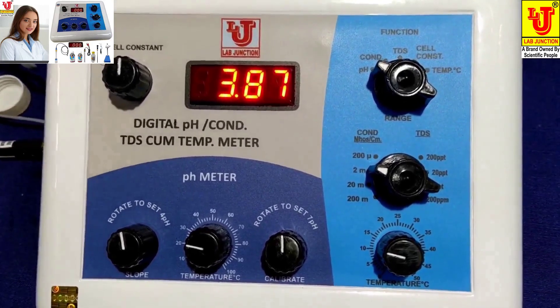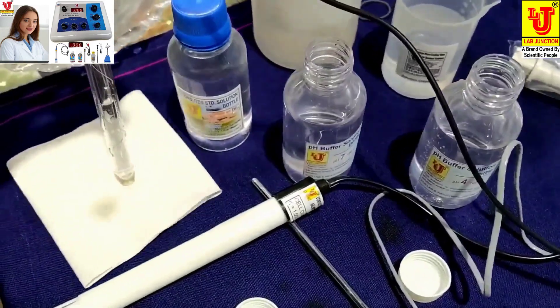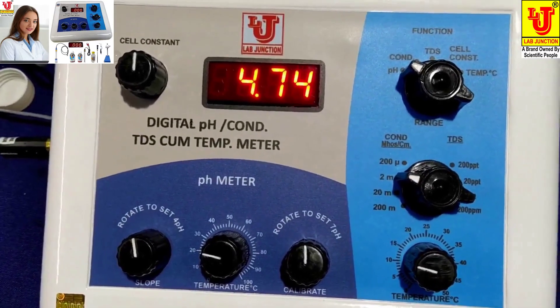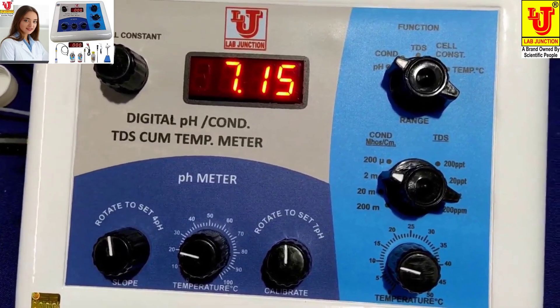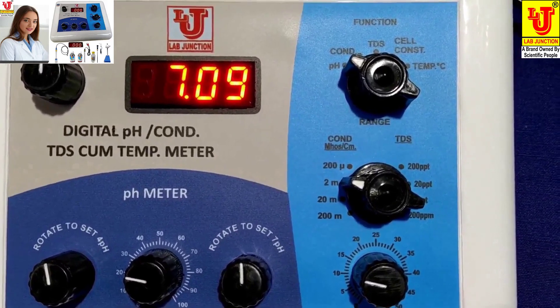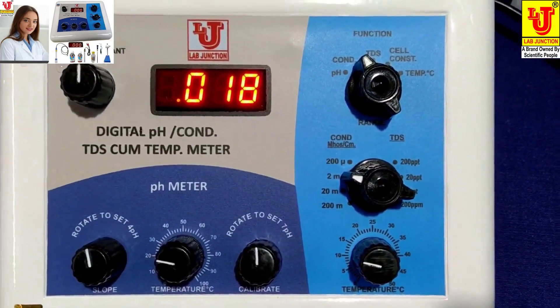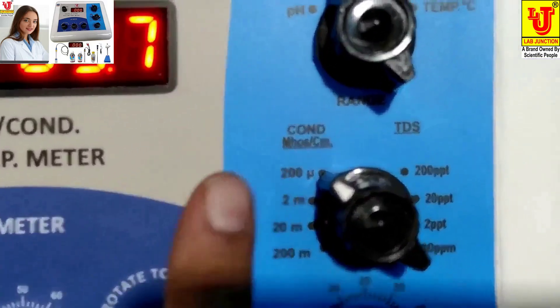Now rinse this electrode and dip it in the sample. After 5 minutes, your reading comes on the display. Now this sample has pH 7.09. Now I am calibrating conductivity — you only have to calibrate conductivity; TDS value calibrates automatically. These are the ranges for conductivity and TDS values.